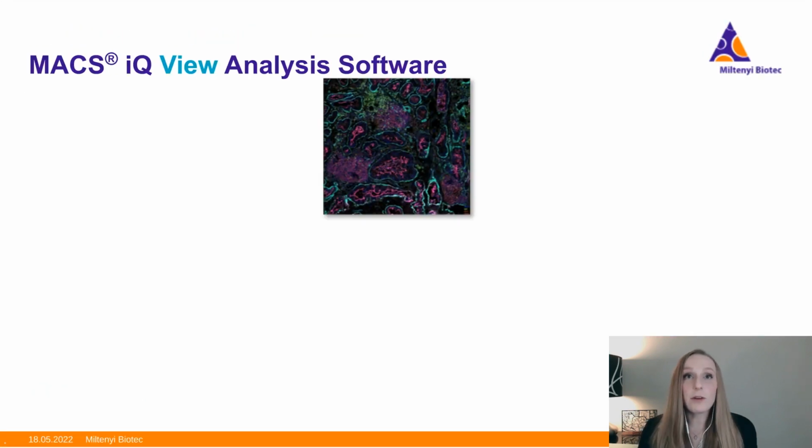While all that's great, we're talking a lot about the efficiency of getting the imaging done, again, everything done in the instrument. Now it turns into, what do you do with the data afterwards? Traditionally, this has been the bottleneck, in the sense that a lot of automation has gone into the imaging portion, but now you need to be able to identify and quantify and do things with the actual data output.